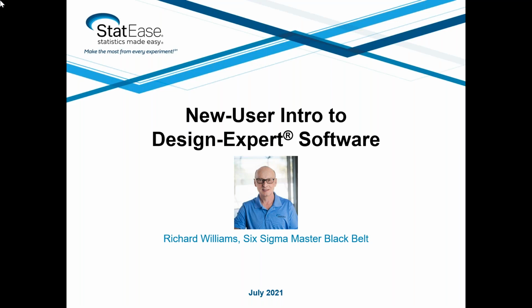In my experience, I feel that DOE has been underutilized for problem solving and process optimization. But equally, I think DOE should be the tool of choice to help us launch reliable products and processes from the very start. This is the idea behind quality by design, or design for Six Sigma. Over the past 10 years or so, I focused on providing training for product and process improvement tools. So today I'm very happy to provide this webinar to get you started with design of experiments.